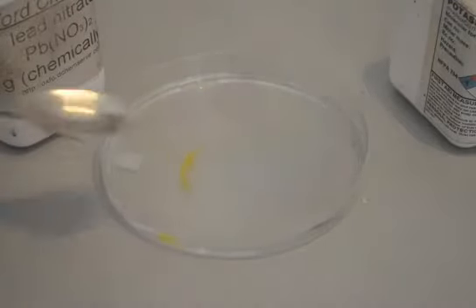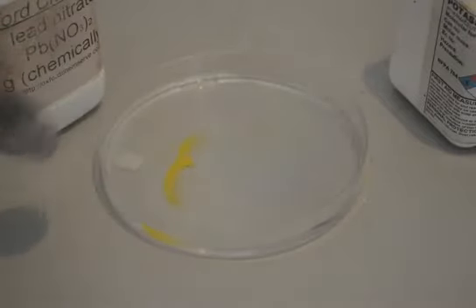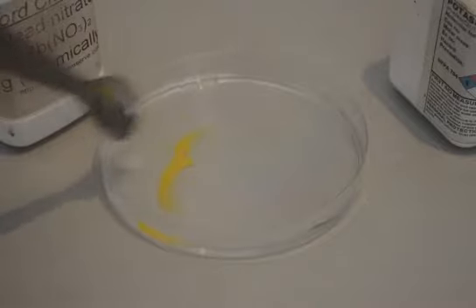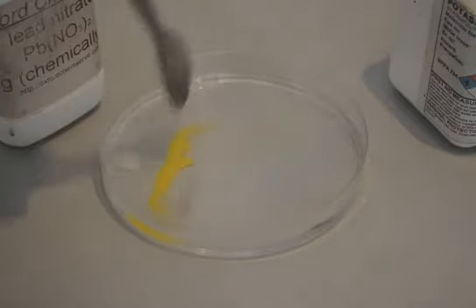Now you can see that it's nearest the lead nitrate, which is good, because that shows that the potassium iodide has dissolved quicker in the water and the lead nitrate has dissolved slower, because that's the biggest molecule. Okay, so we're getting the nice yellow precipitate along that line there.